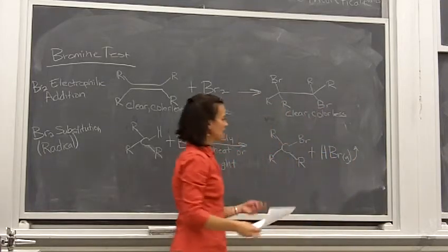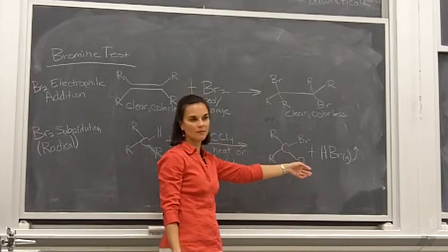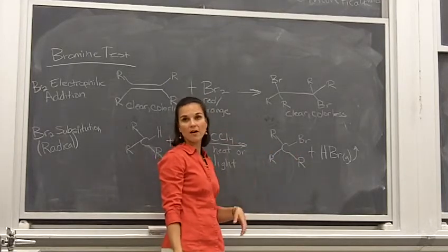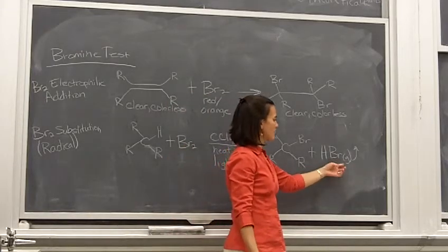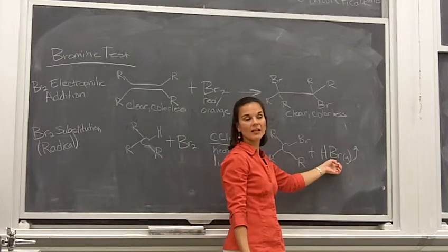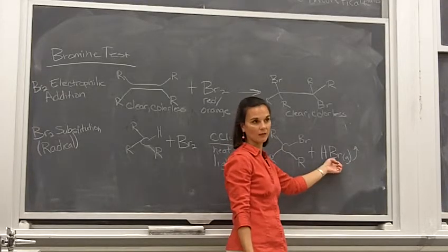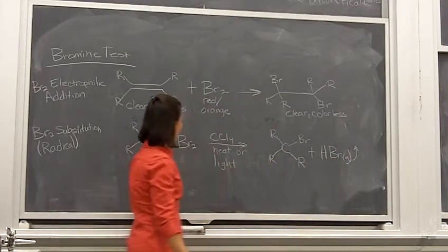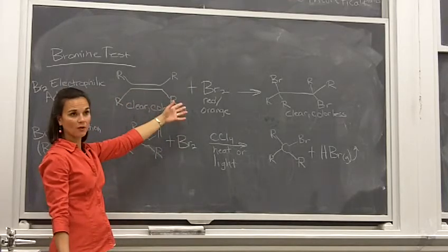And so with the bromine test, after you've added the bromine, you're going to test for the pH of the vapor right above what you're adding the bromine to. It turning red is a possible indication of there being HBr gas that's given off, and so it's reacting with an alkane versus an alkene, okay? Now this reaction is not going to happen as robustly as this reaction, okay?